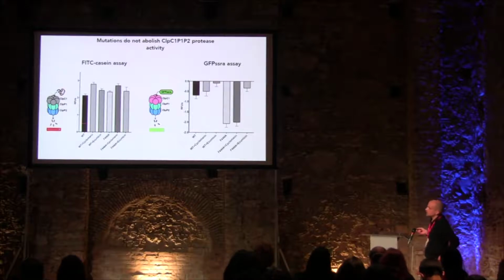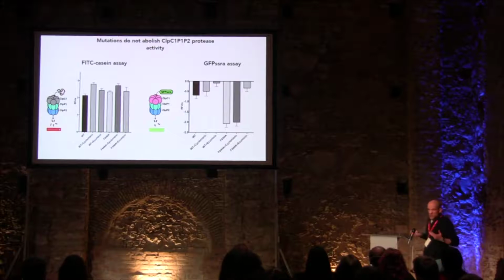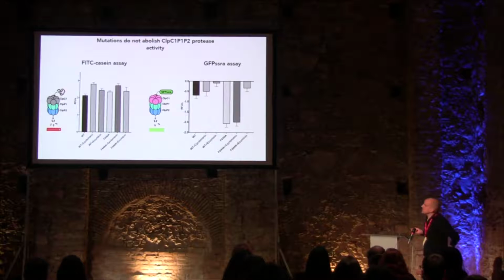Another thing that's really important is to test the full thing, to test if this ClpC1 was also able to bind to ClpP, the protease, and was also able to catalyze protein degradation. And this is more difficult to explain, but I'll try to be as clear as possible. So basically what we do here, we use model substrates. One of these model substrates is casein. Casein doesn't have a defined structure, so it can be considered an IDP.